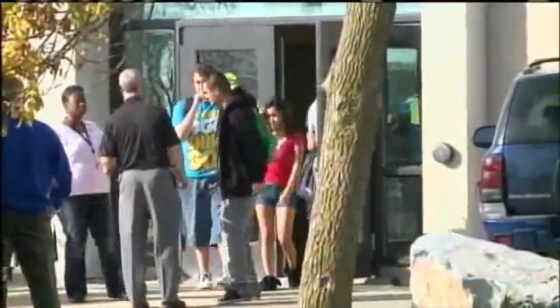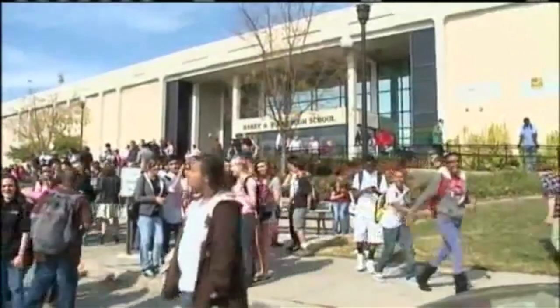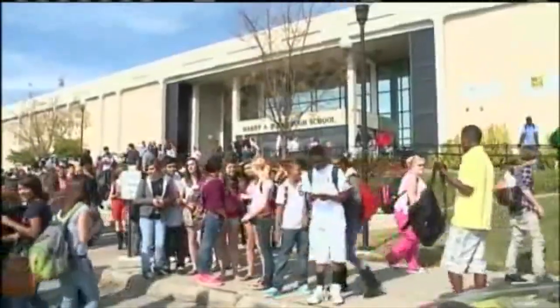It is unfortunate they forgot part of their training and used a vacuum as part of their cleanup procedure. But replacing that piece of equipment was far less costly than had the mercury been transferred to secondary locations. The mercury spill ultimately resulted in the cancellation of afternoon classes and evening activities, and the dismissal of students about 12:45. Weekend activities were put on hold until everyone was certain all the mercury had been found and cleaned up. Before students arrived on Monday morning, a staff member retested the area to verify it was safe for reoccupation. The same year as this spill, another high school very similar in size to ours experienced a mercury spill that cost that district hundreds of thousands of dollars.